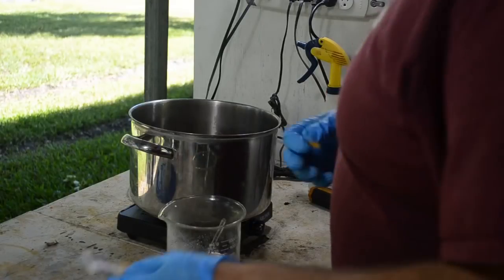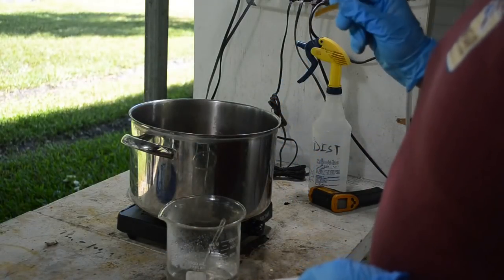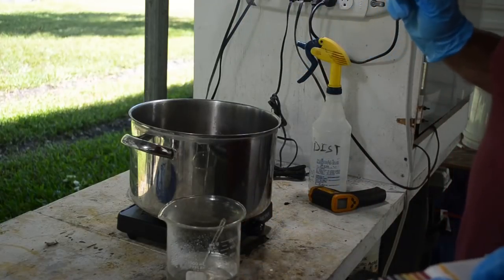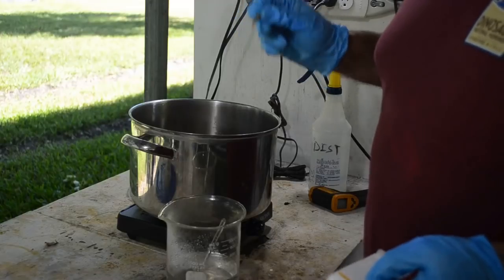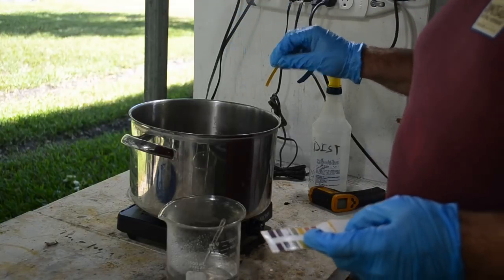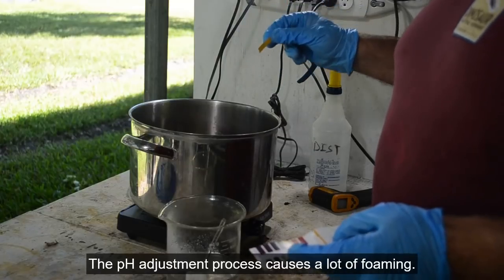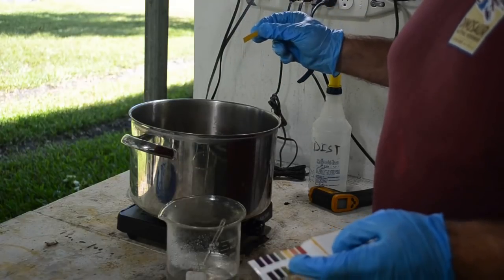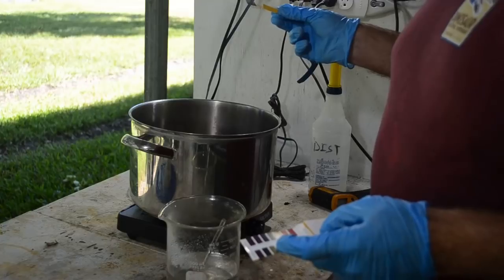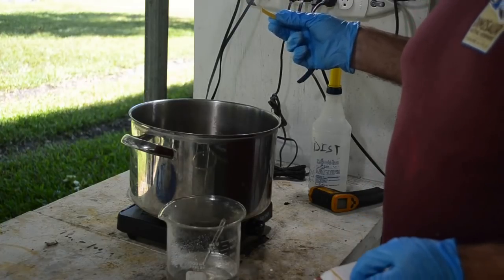Now the instructions do say that this pH adjustment step needs to be carried out in an open area with good ventilation. I don't know if that's just in case, which we talked about earlier, if you drop the pH too fast, too far, it might evolve cyanide, or it does evolve some sort of gas, but I think it's probably carbon dioxide. Not 100% certain. It doesn't really have an odor to it. Isn't nasty, but maybe if it builds up in an enclosed space, it could be a problem.